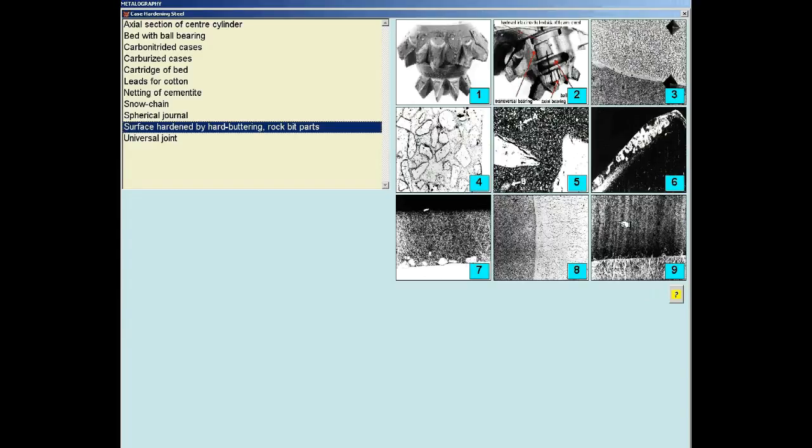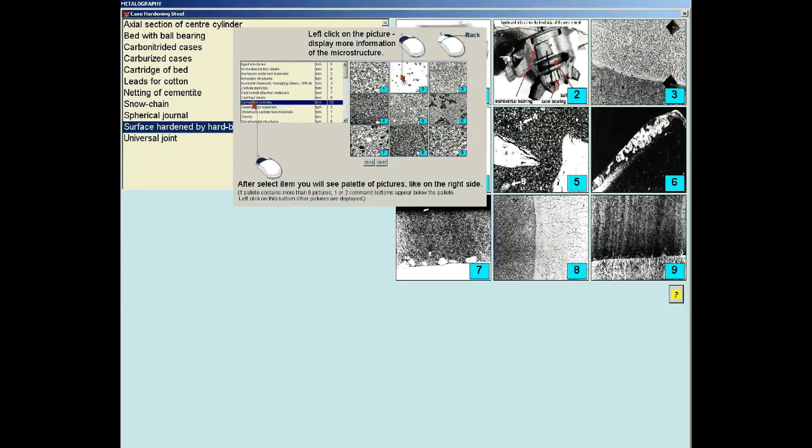On the bottom right, you see a push button with a question mark, and after its activation, you will learn how to use this pictorial menu. When you want to look at the contents of some little picture from the menu, set the mouse cursor on this little picture and press the left button of the mouse. We can go back by pressing the right button of the mouse.